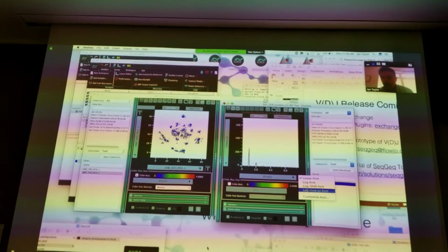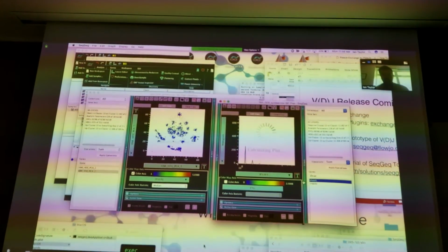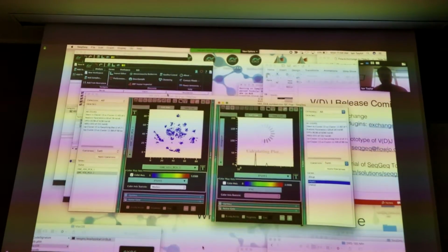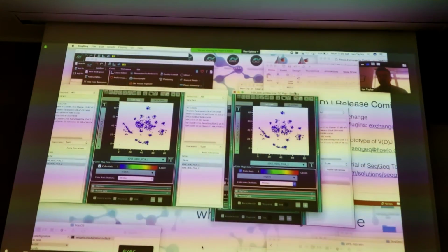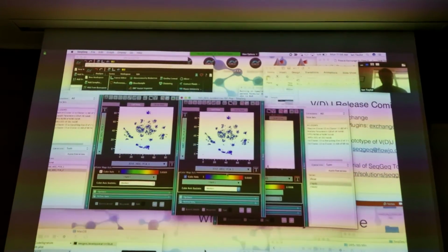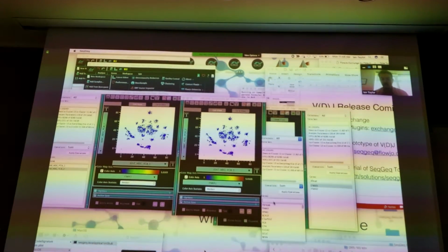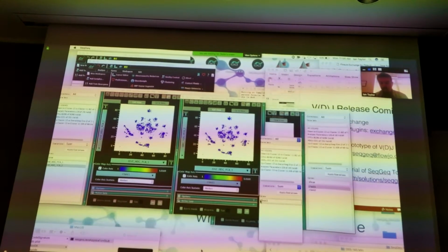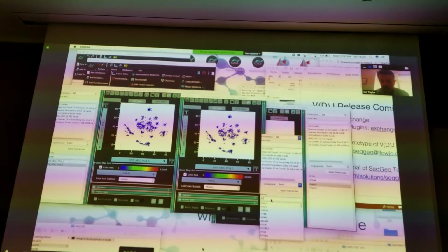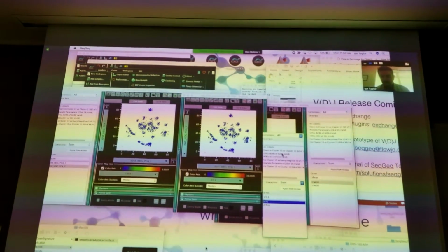IFIT1. Yeah, we're looking at the ones that are high. IFIT1. So there's a lot of IFNAR1 and IFIT1. Oh, this is going to be fun. Did I get that right? Yeah, that's right. IFIT1, no N. IFIT1.